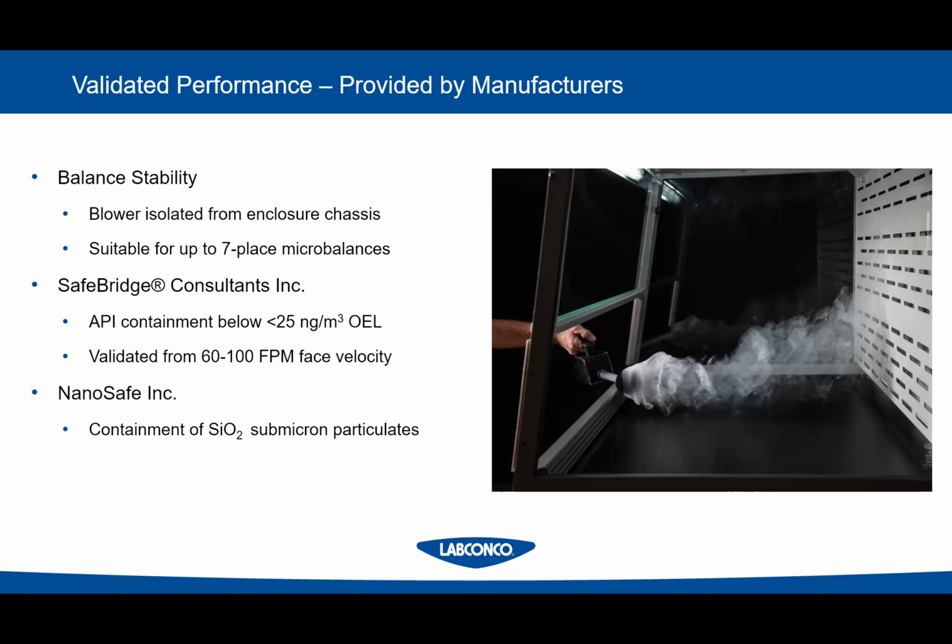But just remember that different particles aren't always measured the same way, right? There's different ways to measure things. If we just did our traditional particle containment on nanoparticles, some of those sensors aren't even sensitive enough to pick up that small of a particle. So we switched over to something else to make sure that we get that containment. Just ask your manufacturers, what do they have? Again, all of these are kind of in a test facility, but it gives you a good idea of what it can do for you for what you're working with.